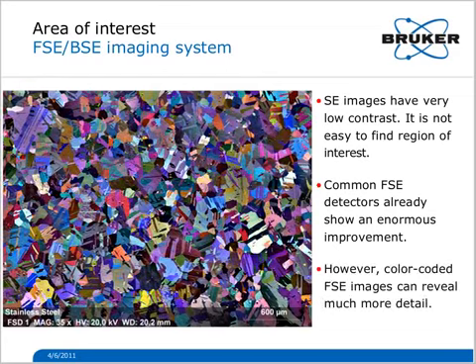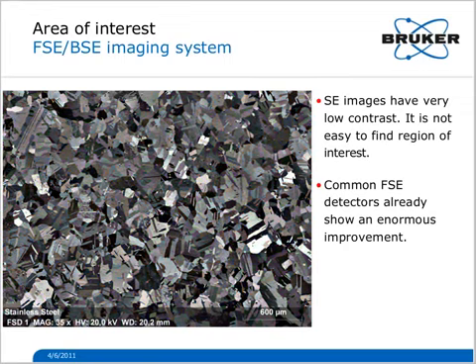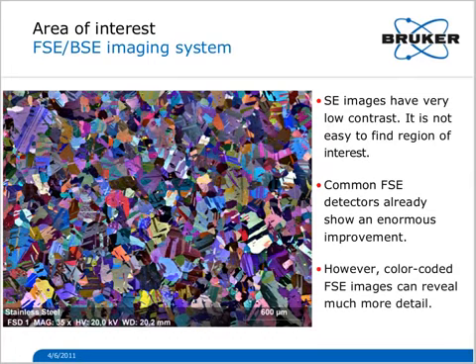If we switch to our colored mode, you see then that in many images, for instance, please take this grain here into account. And if I go back, for instance, to the grayscale image, you see there are no grain boundaries or twin boundaries anymore. The same happens, for instance, in this grain here. You see it here. We have again twins, which we can't see because simply they're grayscale. If you transfer this color into grayscale, they are similar.